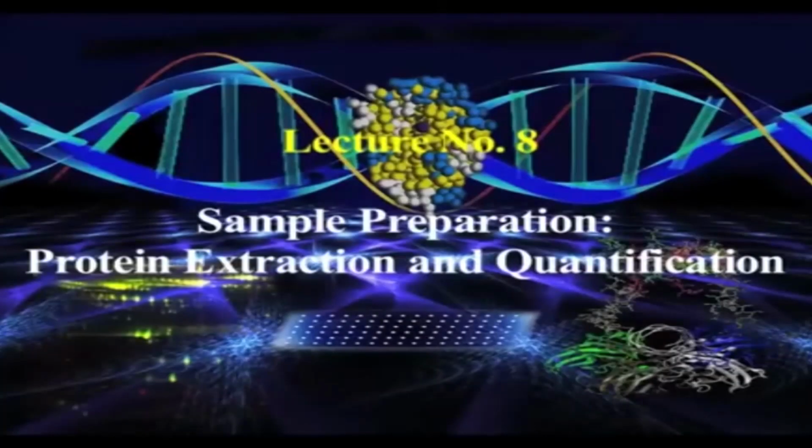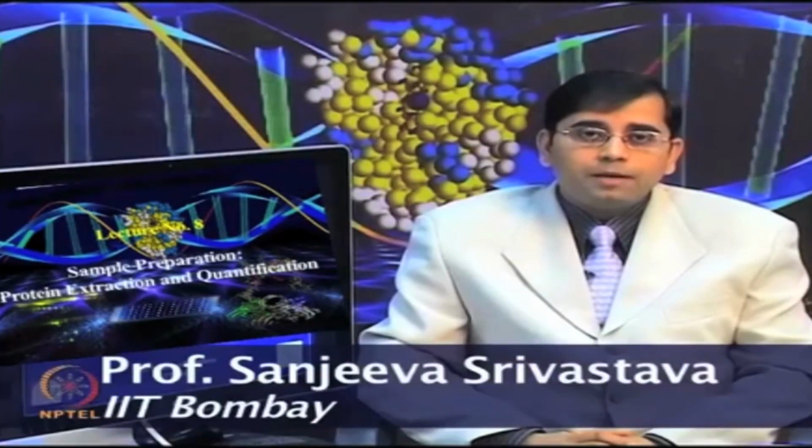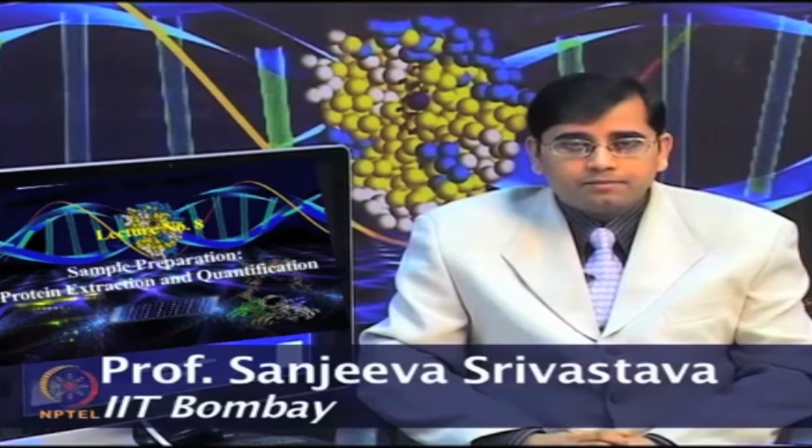Welcome to the Proteomics course. Today we will talk about sample preparation for proteomics applications with a special emphasis on bacterial proteome analysis and protein quantification. In the last two lectures, we discussed different methods which can be used for very good protein sample preparation for proteomics applications.